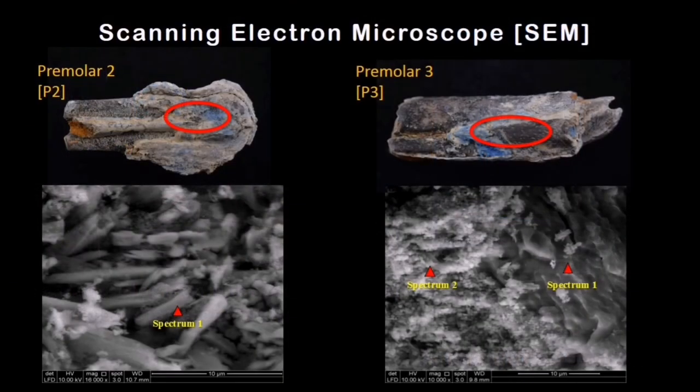On the SEM you can see the black and white images. I labeled Spectrum 1 for Primola 2 as the focal area — you can see there is some crystal-like structure. For Primola 3, Spectrum 2, if you look carefully it appears rather granulated, while Spectrum 1 looks flat, probably the surface of the tooth itself.